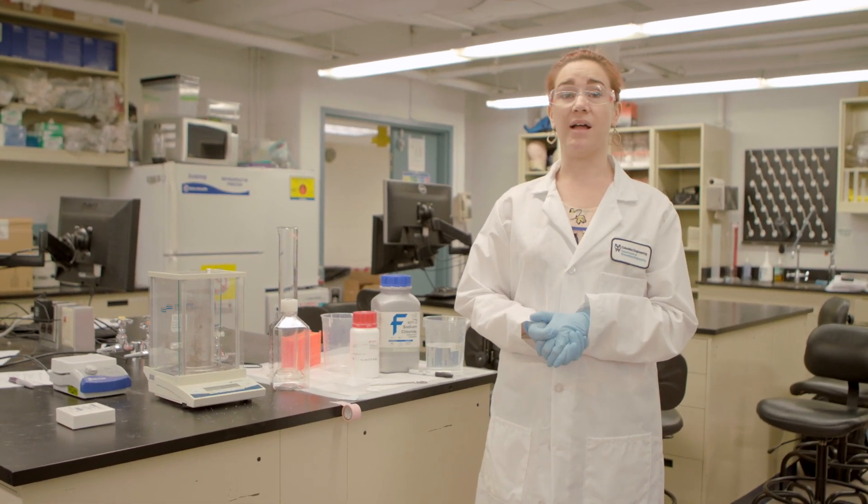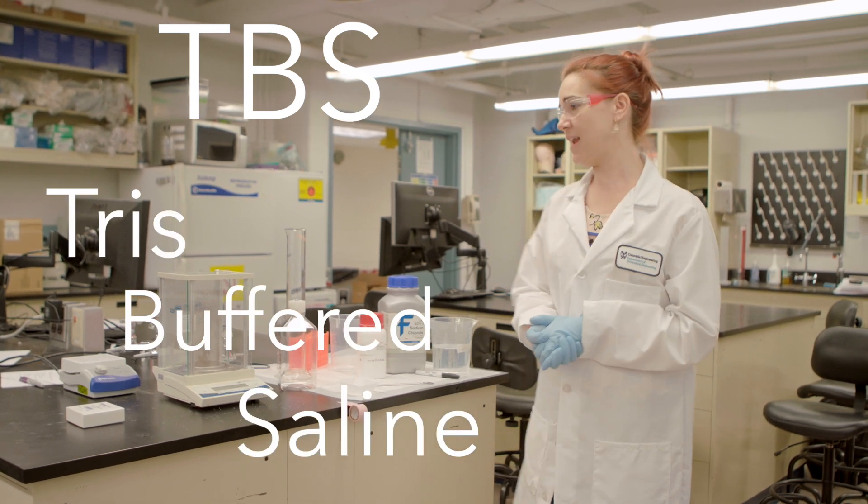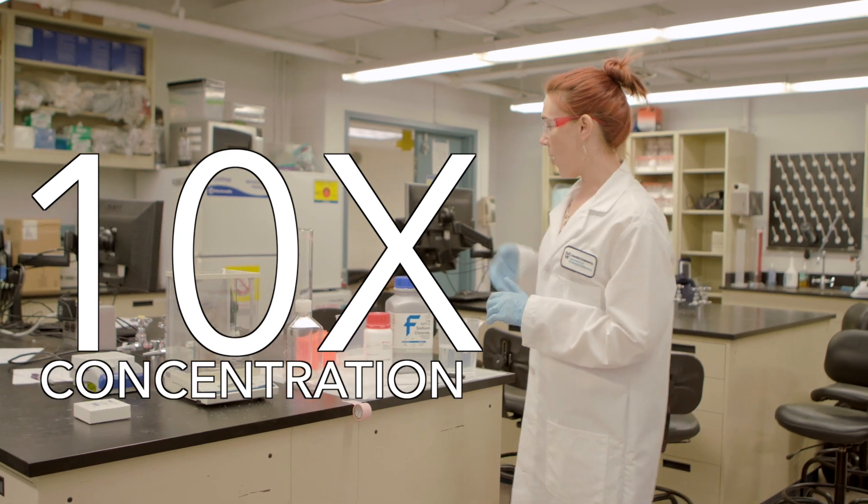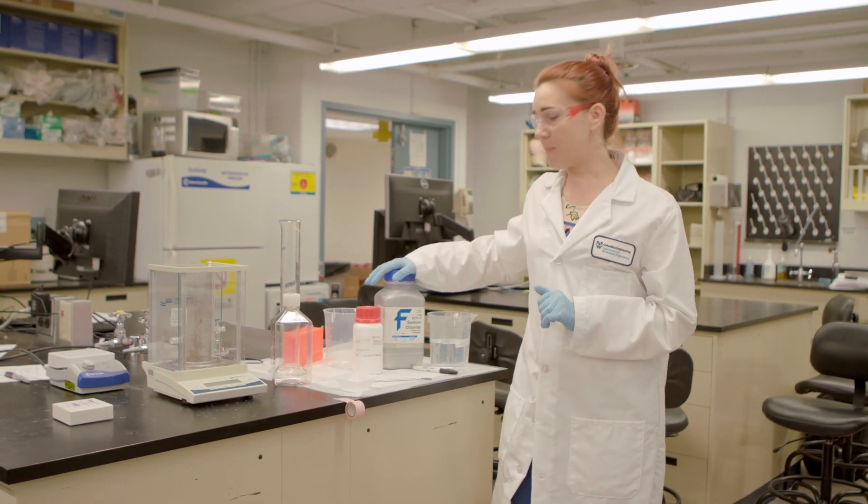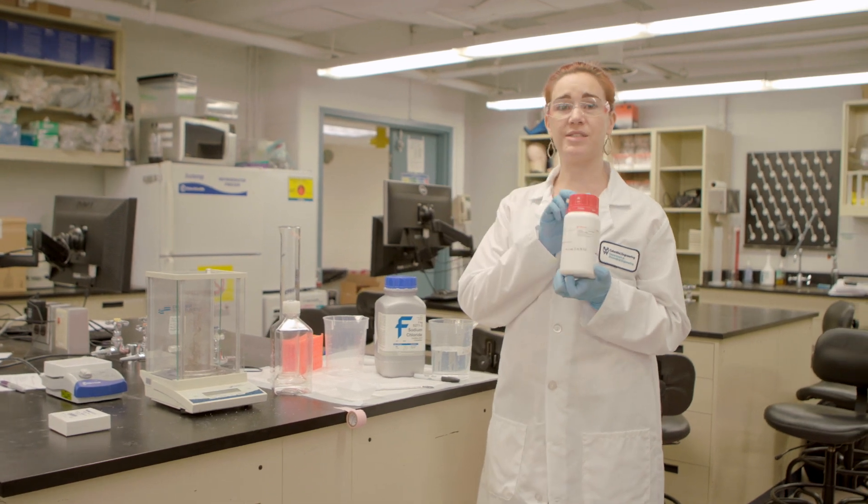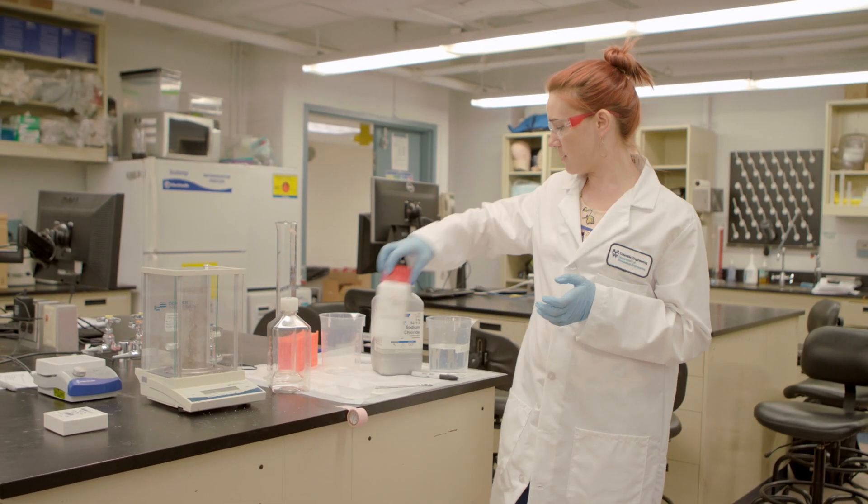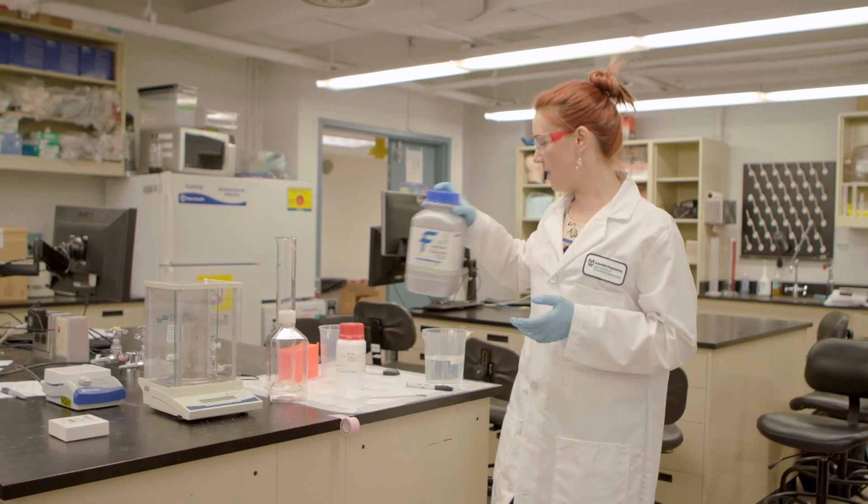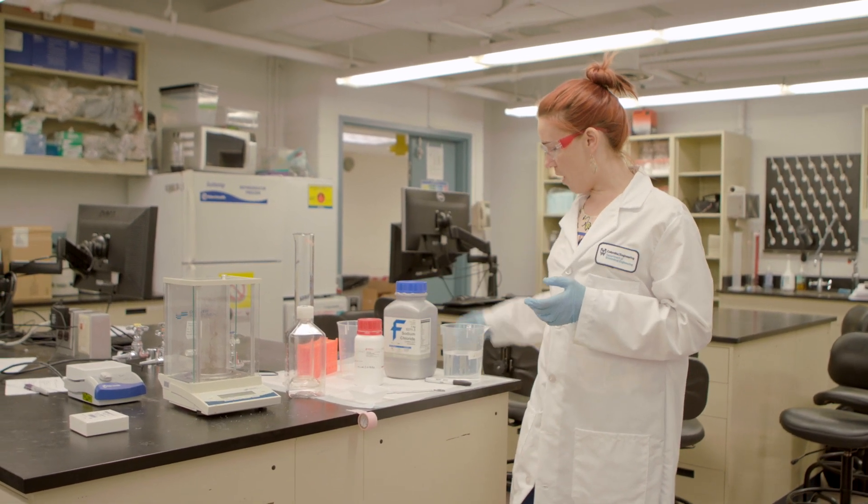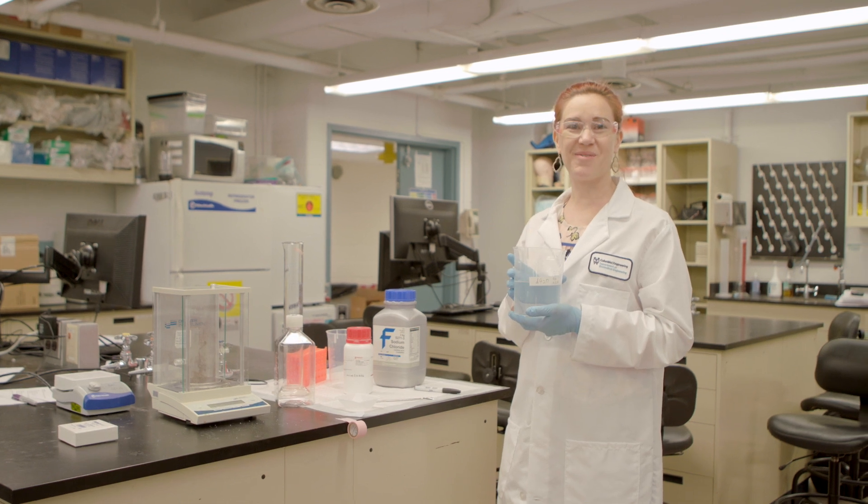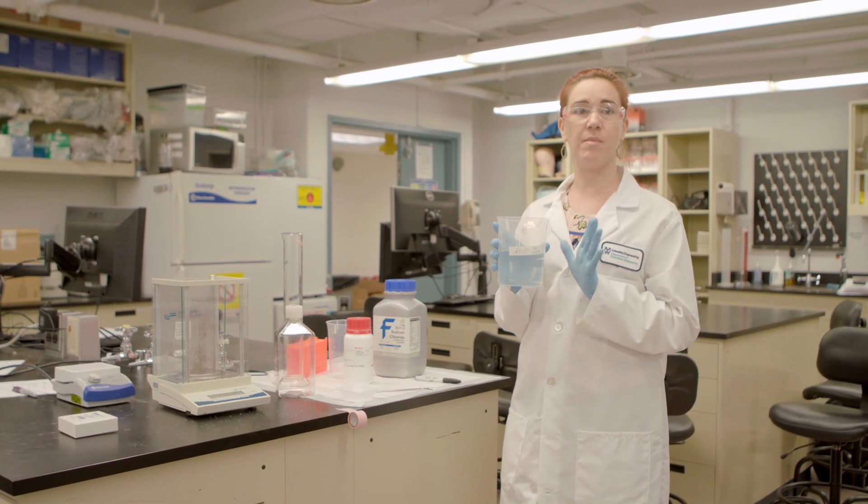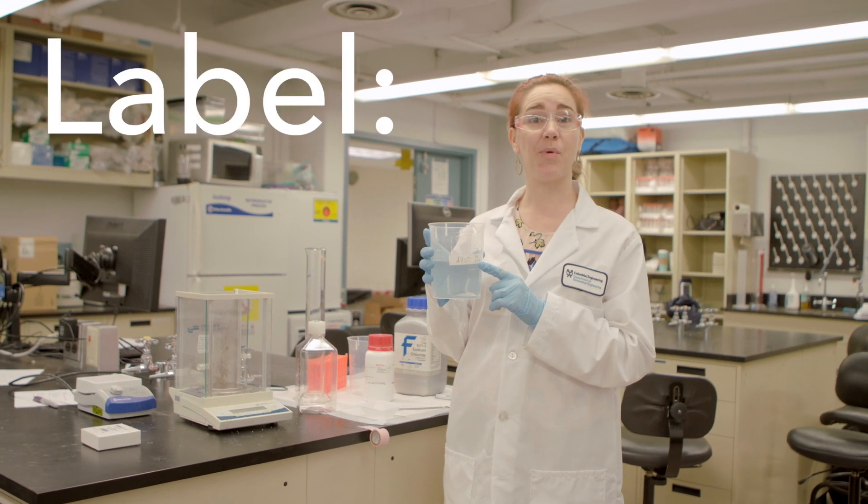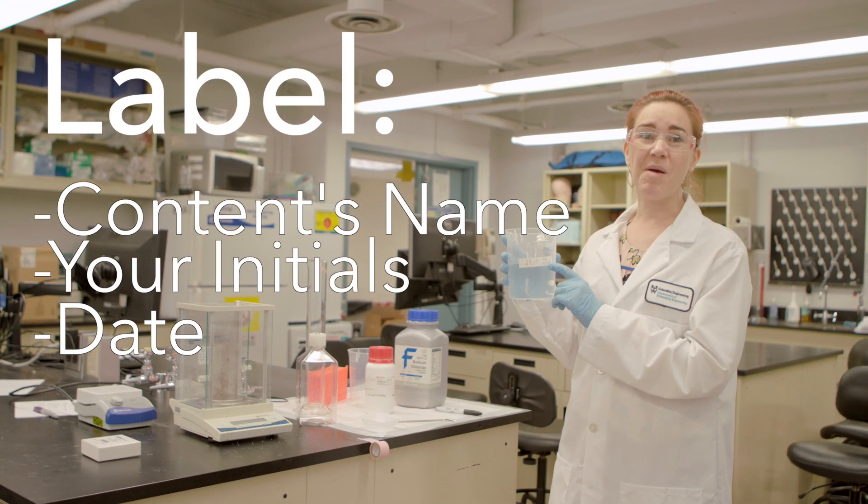We're going to make TBS or Tris Buffered Saline today and we're making a 10X concentration. I know from my protocol that I'm going to need three ingredients: Tris or Trisma Base, NaCl or Sodium Chloride, and Distilled Water. I have my labeled liquid here because it's distilled water and because it's clear liquid in the lab, I open a container and make sure that I have a label with its name and my initials on it.